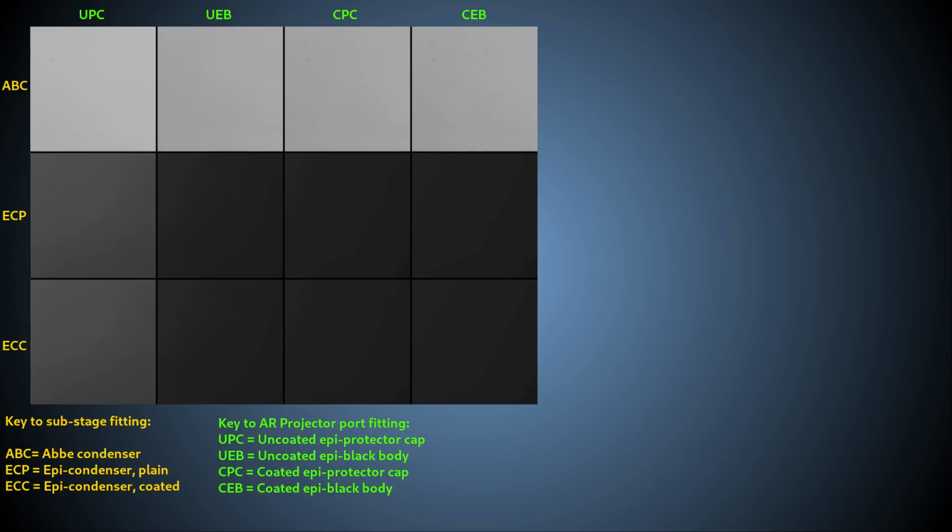Here is a comparison of the field of view down the microscope using various light sinks or none at all, with and without the anti-reflective Event Horizon coating. The tests all use white light epi-illumination without a sample on the stage. A perfect system would show a completely black field of view. For these comparisons, I've used the same camera with the same manual settings for gain, shutter speed, exposure, etc. The illumination intensity is also constant between tests.